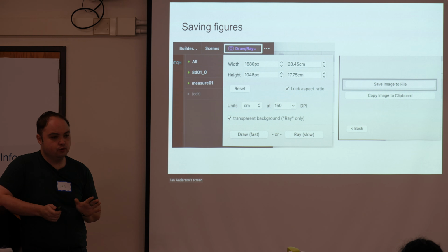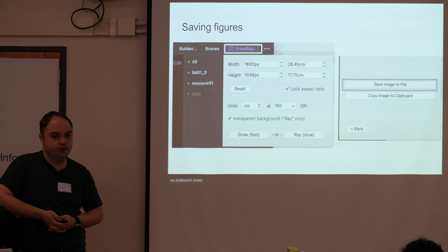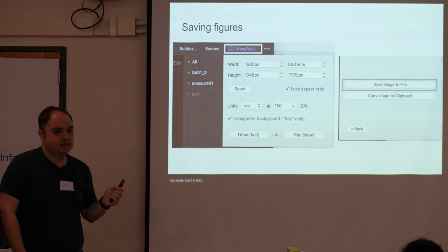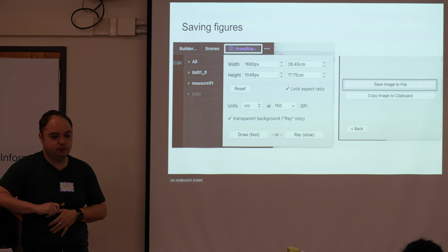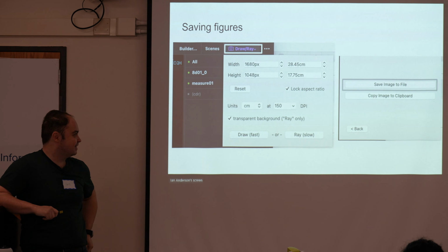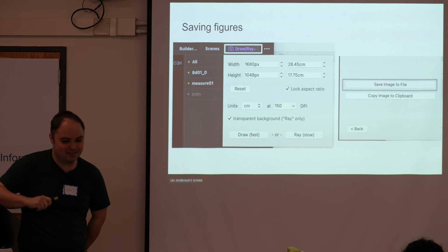But there's a great community online of people who are really interested in doing high quality protein renderings in PyMOL, and they have their own settings that you can just take to render your proteins any way you want. One thing I will say that I've always noticed is that people pay attention to your talks more when your proteins are very beautiful, and it makes everything better. So I do recommend the aesthetics, even though it feels kind of awful caring about the aesthetics, it does help.